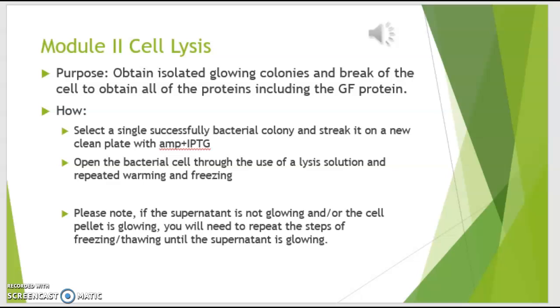So in module 2, it's known as cell lysis, and lysis means to break down or break apart. So as it mentions, we're going to be breaking down the bacteria so that we can get those proteins of interest. As it mentions, you would select a single bacteria. You would open the bacteria cell through a lysis solution, which essentially just breaks down the cell through repeated warming and freezing.